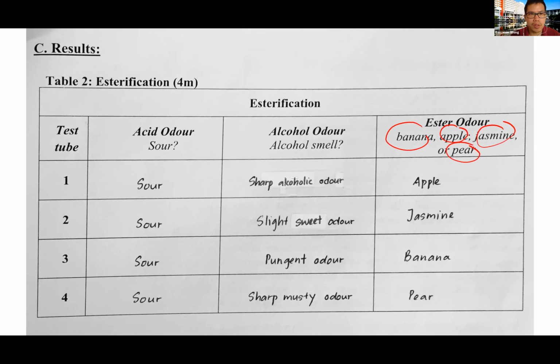For this case, I will give you the table to copy down into your report. I will give you 4 marks here. Because this part cannot be justified from your side, there's no discussion for it. Only the first part of the experiment has a discussion. For this part, you only need to do the practical, the pre-lab, and the esterification table over here.